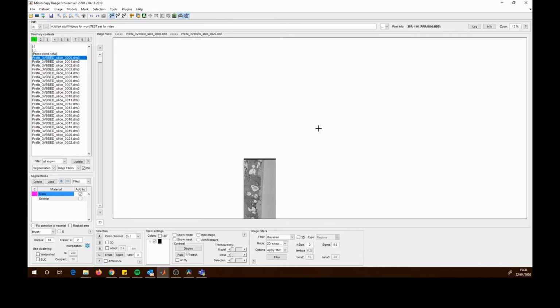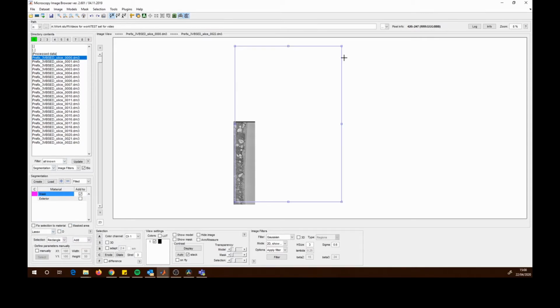In that case, it would make all of this region, which I can show you now, all of that area there would then be classified as the image. As you can imagine, that increases the memory size of the image vastly. So, if this occurs, it will fill the RAM and immediately cause an out-of-memory error in MATLAB. So, if that happens during the alignment, that's what is worth looking out for.